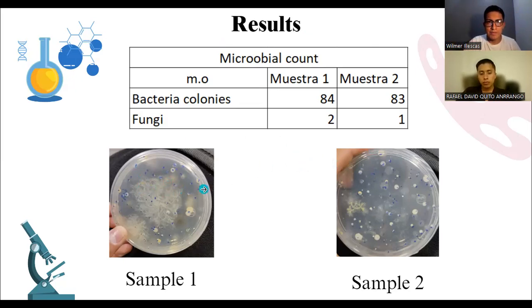Sample 1 was put in a place which is much more crowded by people. Sample 2 was on a book shelf in a place where many products are, but sometimes nobody passes; it's not usual that people pass through that place.